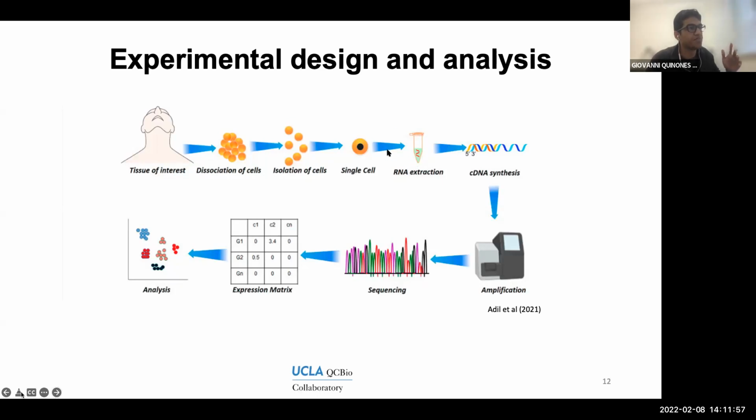This step is mostly chemistry. We're not going to get into the details of the chemistry that takes place. So we're just going to briefly mention how the RNA is extracted from within the cell. Later on, we cannot directly sequence RNA. So what will generally be done is that this RNA molecule needs to be converted into cDNA. And cDNA, which stands for complementary DNA, is the one that we can actually read with the sequencing machine.